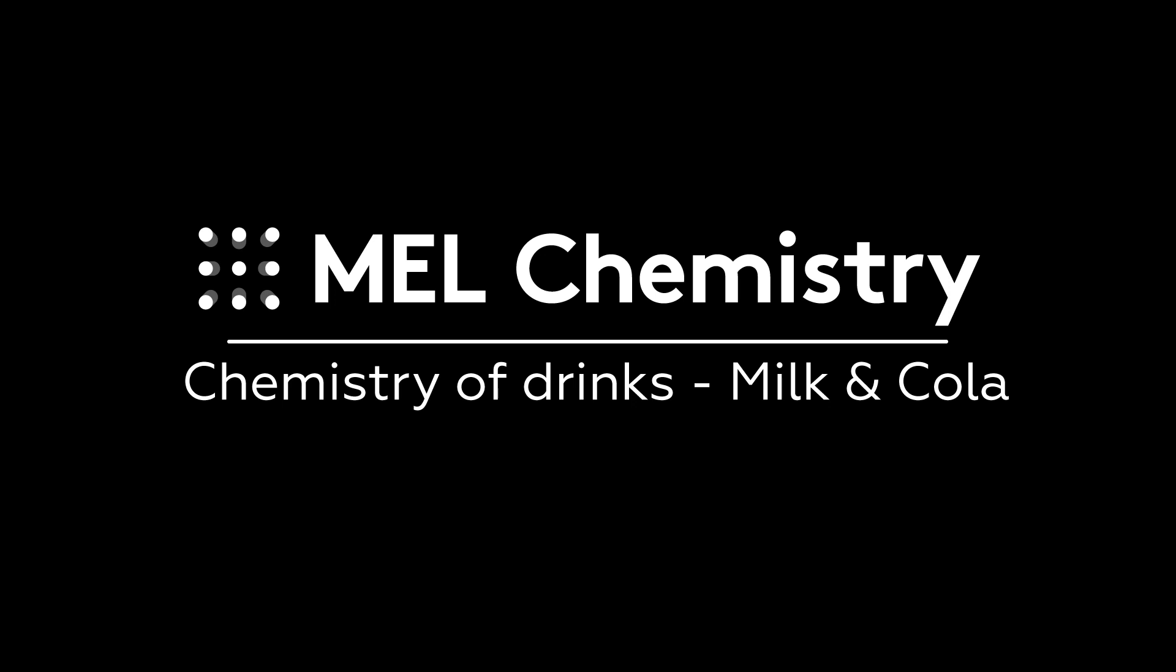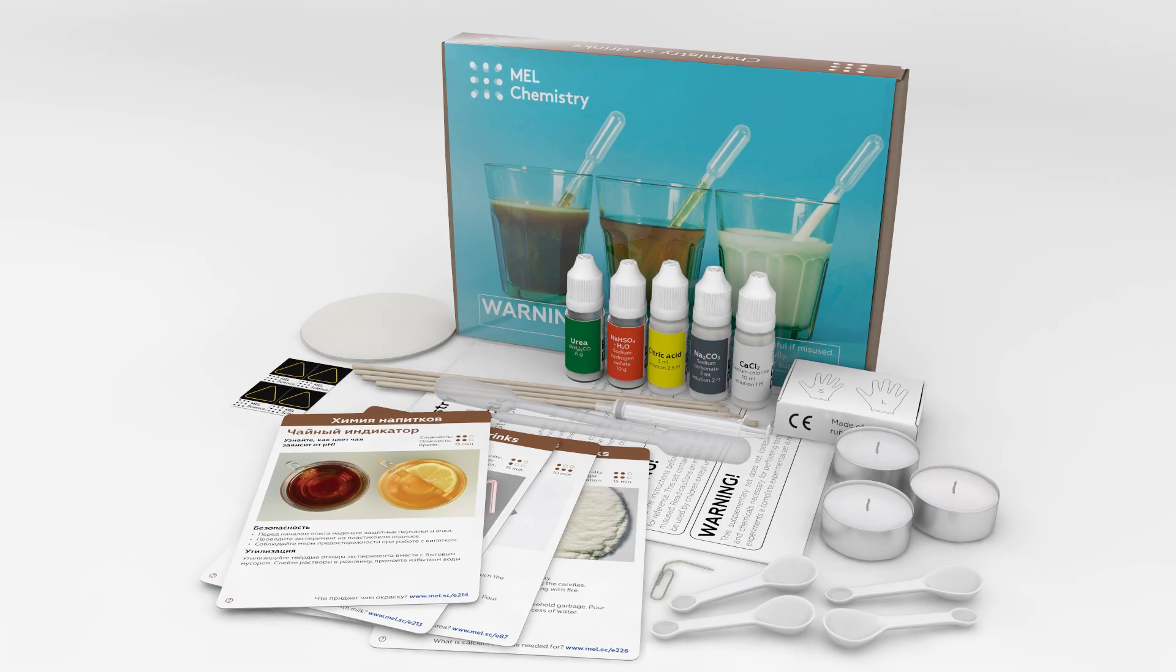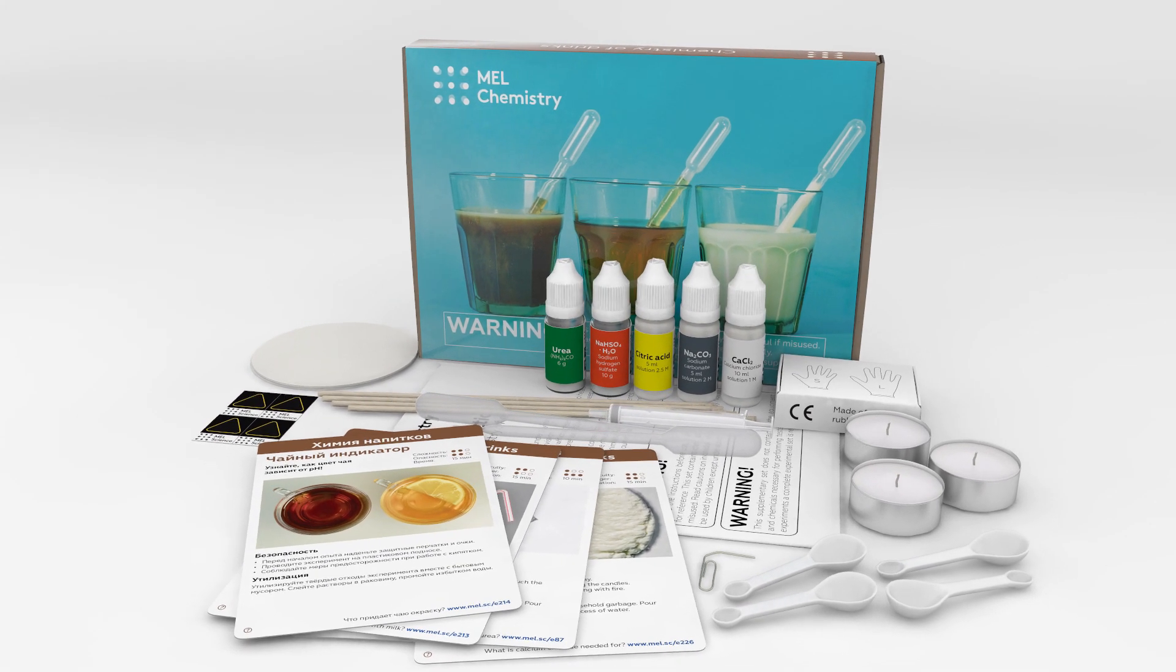Welcome to the wonderful world of chemistry. Today with the help of the chemistry of drinks set by Mel Chemistry, we will see what happens if milk is mixed with cola.